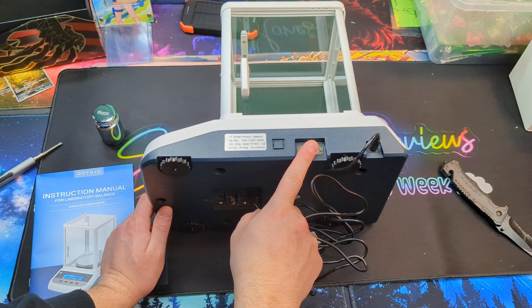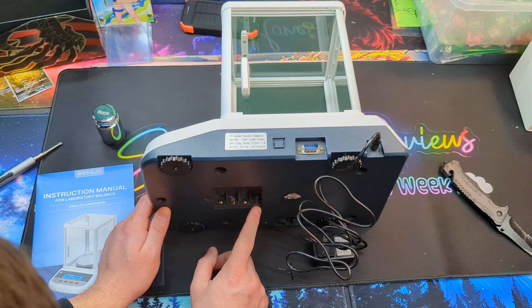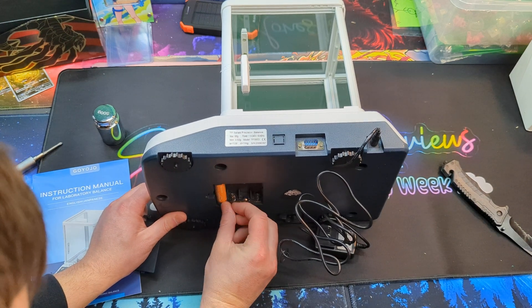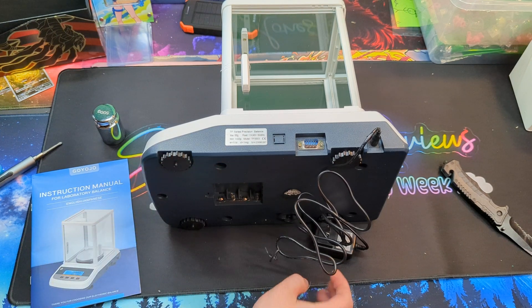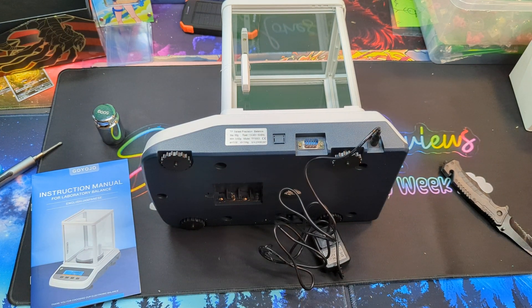On the side you can connect it with other accessories, but also on the bottom it looks like it does take batteries if you don't want to use it with power. It takes four double-A batteries, so it can definitely be portable.